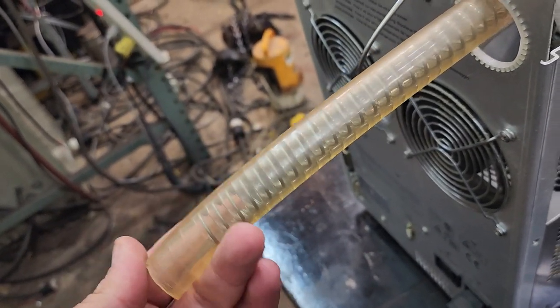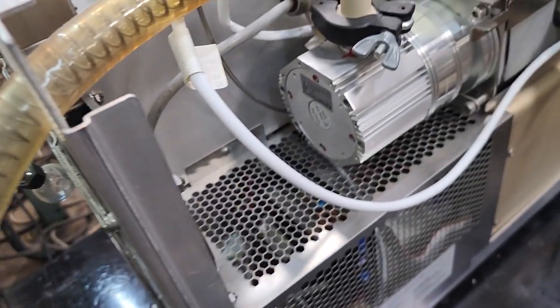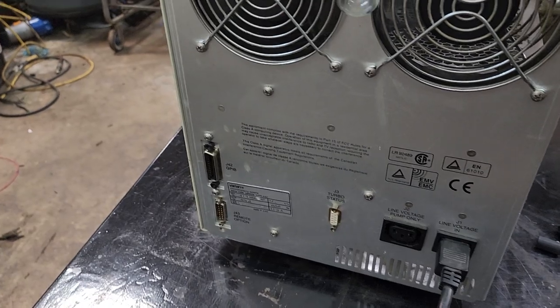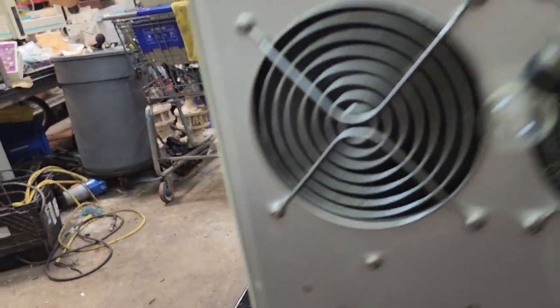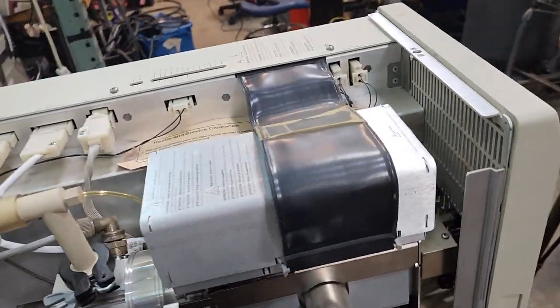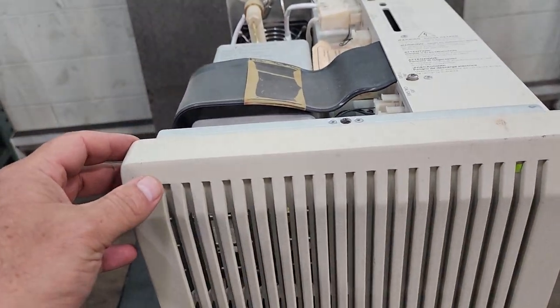Like I said, this is a really small vacuum pump, but that is a turbo molecular pump. I'm not sure what else to show you, but that's the unit. If you have questions or concerns, let me know. Thank you.